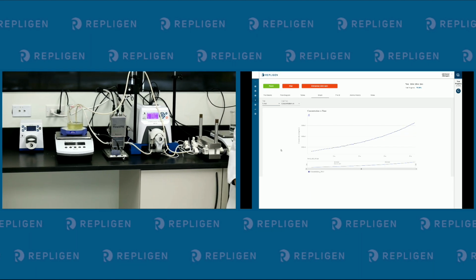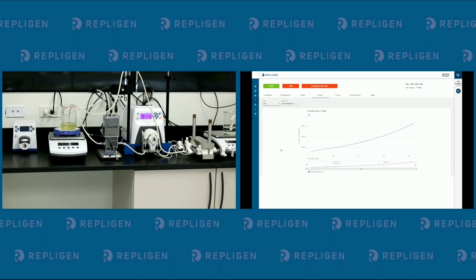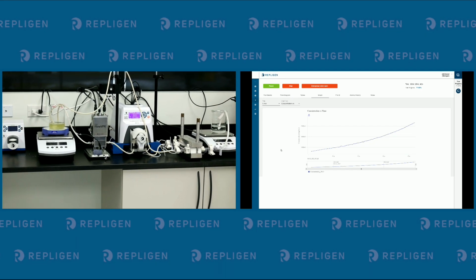So what's nice is what you'll see me today is we'll not touch the system at all. The Flow VPX is going to do everything. It's going to concentrate up. It's going to stop the main pump once it reaches the concentration and actually end the run for us, which is really nice. Moving over, we have the main pump, which is currently flowing at 120 mils per minute.